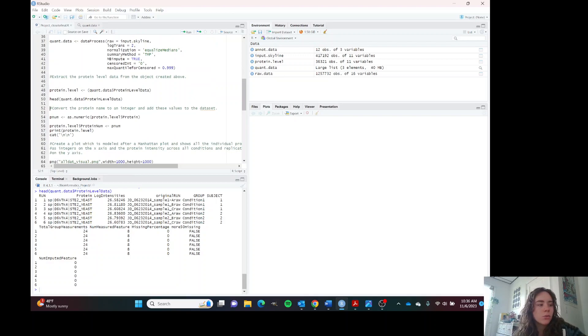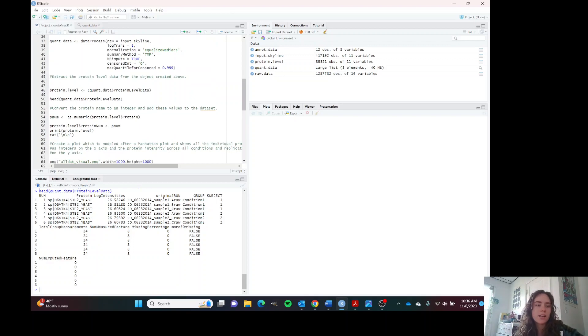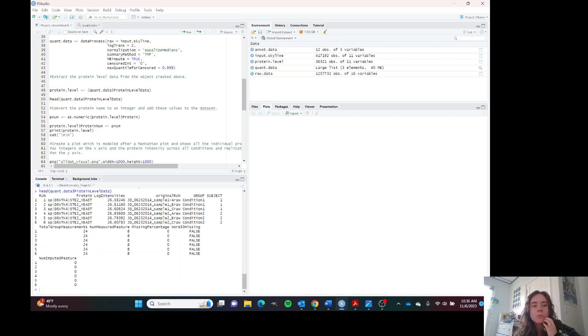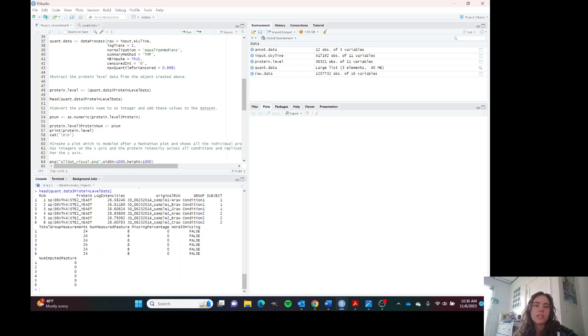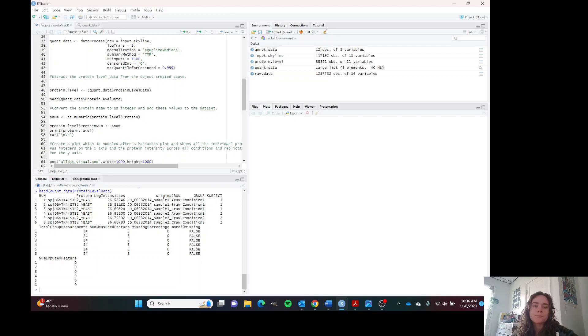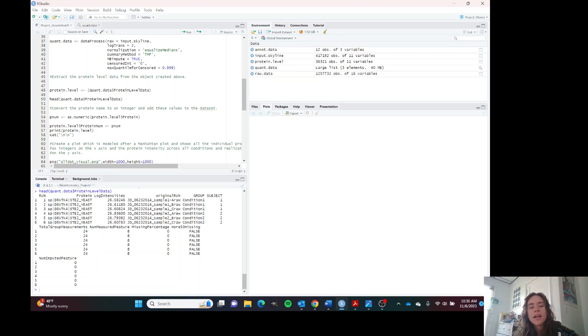We are going to move on to plotting this data. The issue is that our protein names are not numbers. They're not integers, they're factors. We need to change that because the plot that we are going to be doing is modeled after a Manhattan plot.